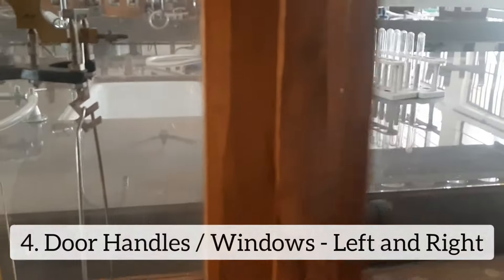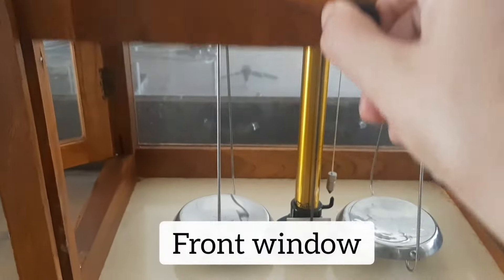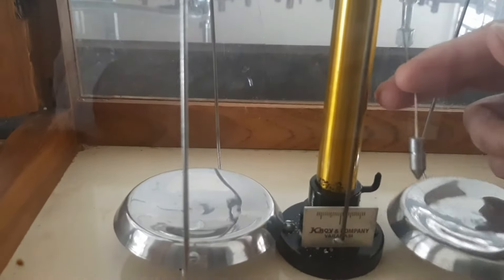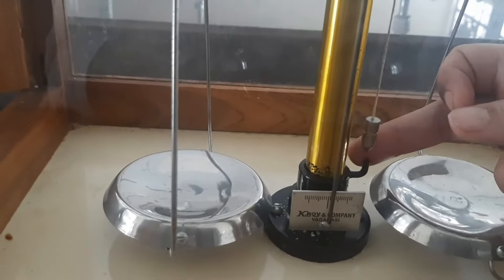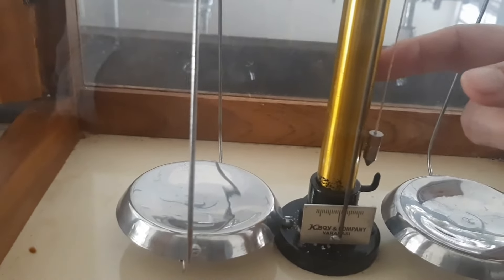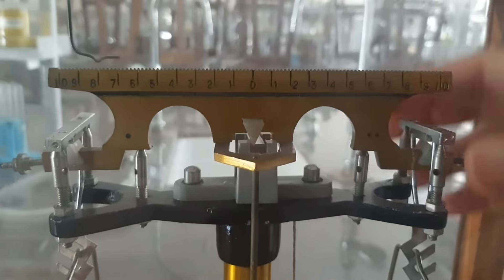Here I have one window to this balance, another window on the side, and a front window which can open or close. This line that you can see here is called the plumb line. Before I start to weigh anything, I have to make this plumb line vertical and in sync with the pointer below.